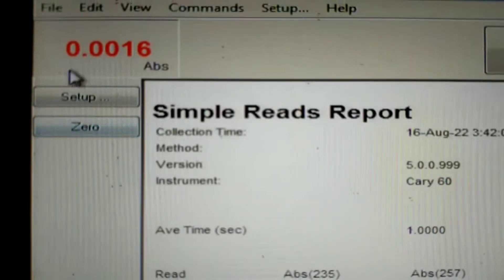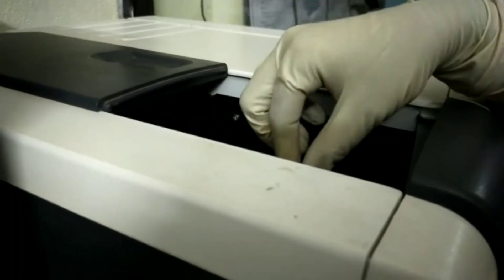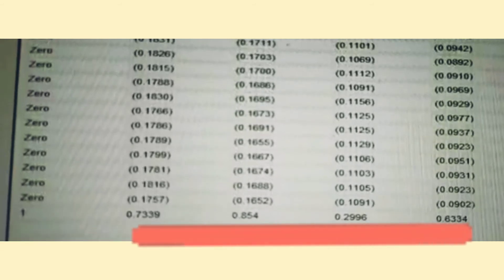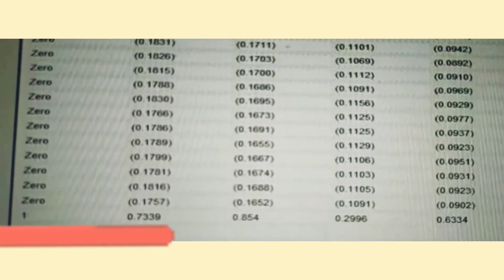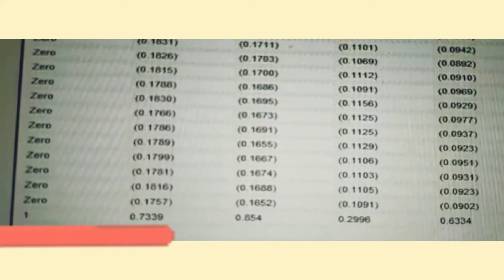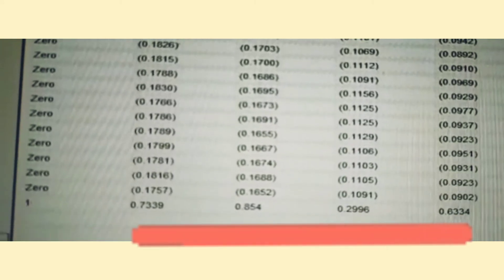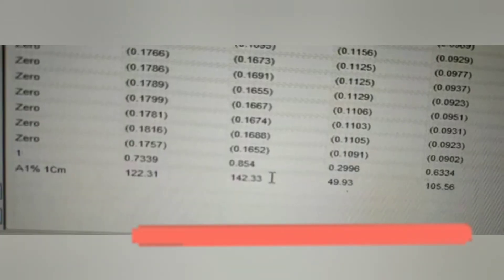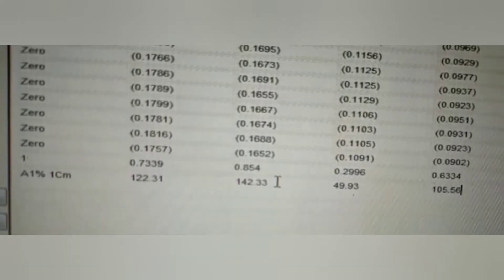Now I will be placing the sample, that is potassium dichromate solution. Here are the readings: the absorbances obtained are 0.7339 at 235 nanometers, 0.854 at 257 nanometers, 0.2996 at 313 nanometers, and 0.6334 at 350 nanometers respectively.